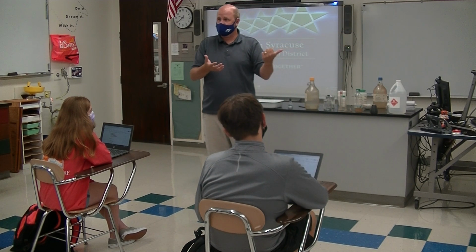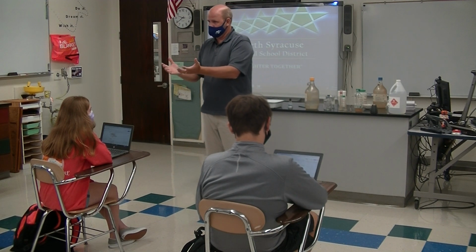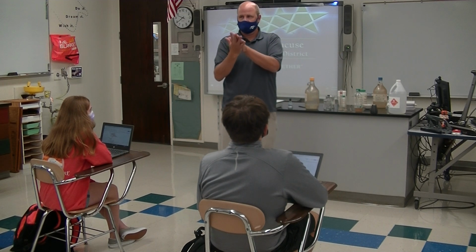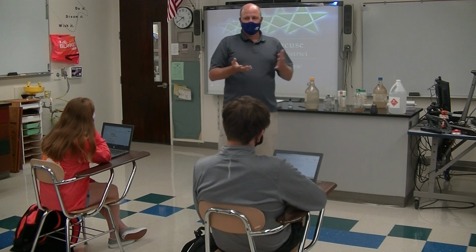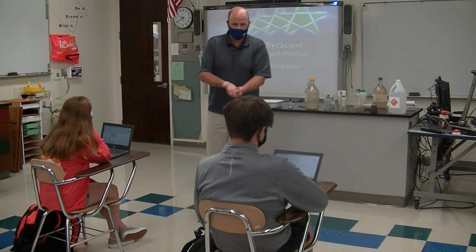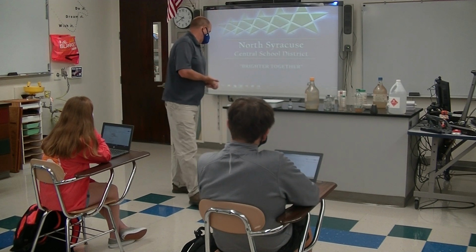So the teachers, in the meantime, the two teachers who were covered with acids, cleaned up, got different clothes or lab coats or whatever. There was two other chemistry teachers who went in. Because it was an acid, they took all the bases in the prep room and threw it on the acids. Acids and bases neutralize each other. So they basically made water, but they had a big mess to clean up. So was that an intentional thing? Did that teacher plan on doing it at that point in time? No shot. All right, but it happened, and it's something they had to deal with.